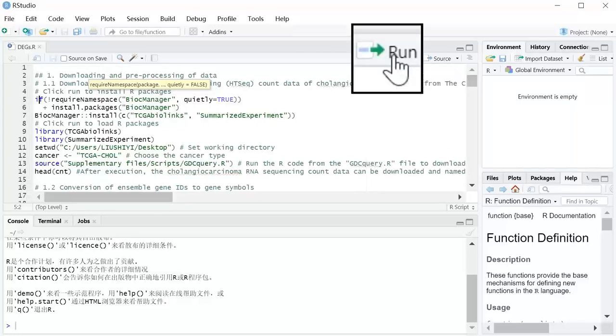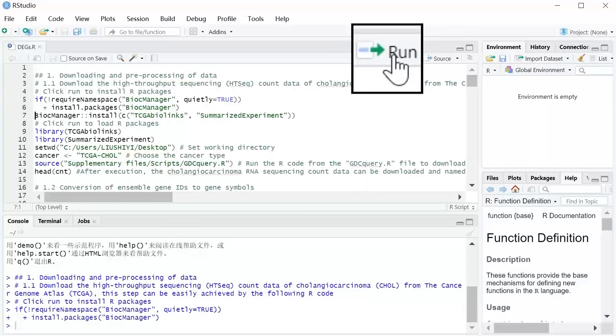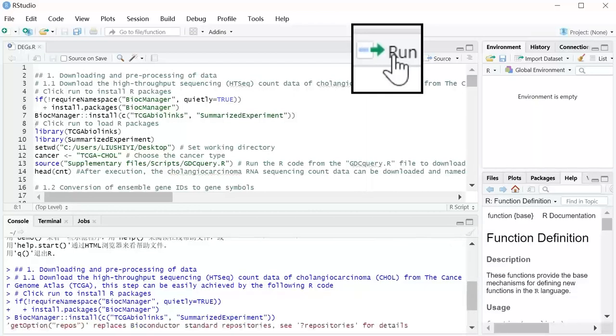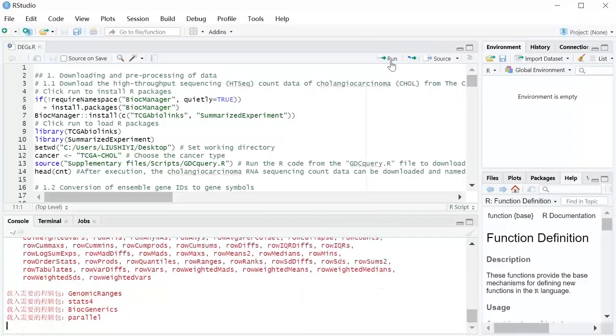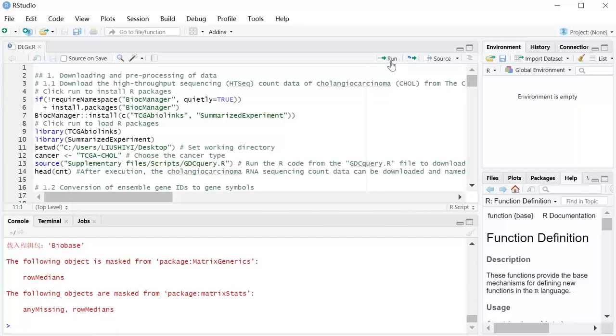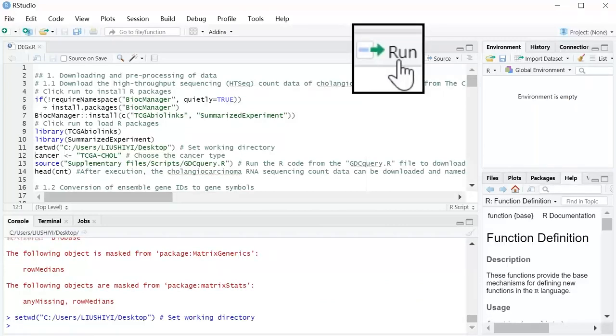Click Run to install the R package. Click Run to load the R package. Set the working directory.